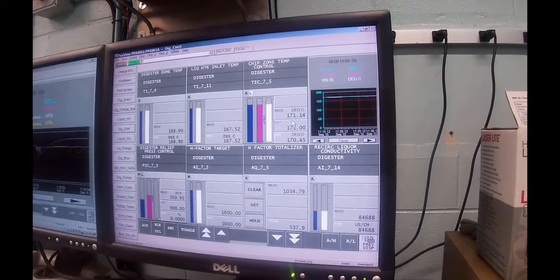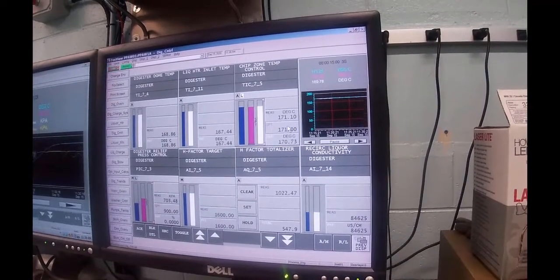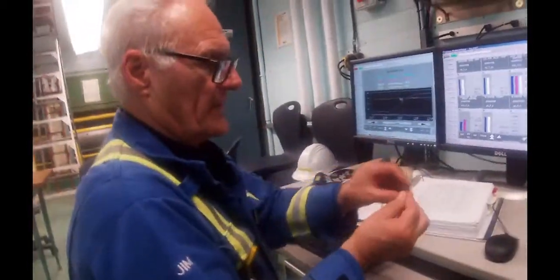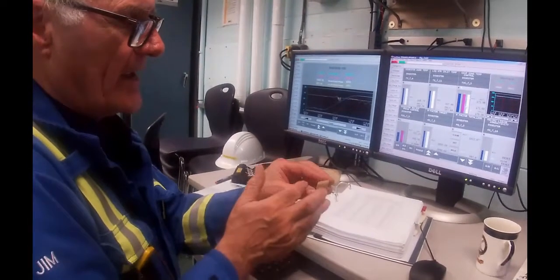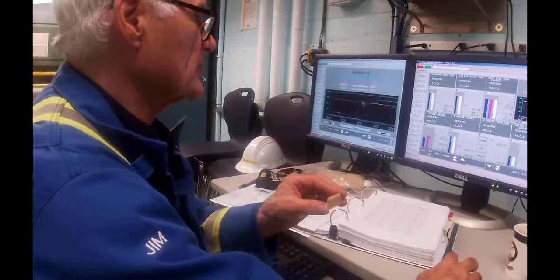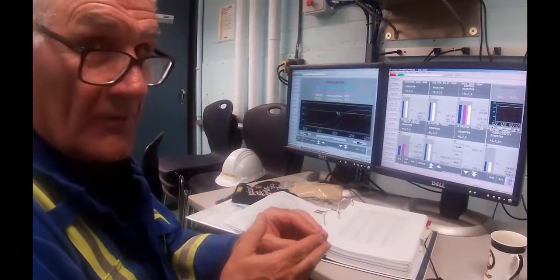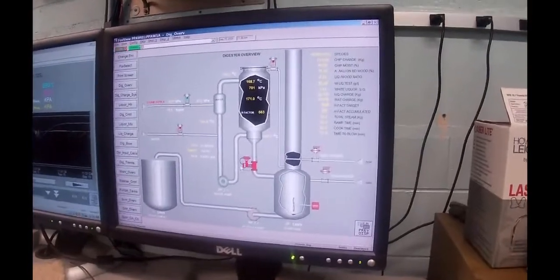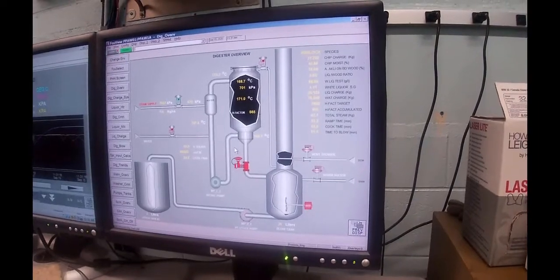The disadvantage of doing that is that when the digester blows, and I'll talk more about the digester blowing in the next part of the video, if the chips are really hot when they blow apart, it'll tear the fiber. The chip itself still looks like a chip inside the digester, even though all the lignin is dissolved. When you open the blow valve, the pressure drops, and the water inside flashes into steam, because inside that digester we're running at a digester pressure of 700 kPa right now, and when we drop the pressure down to zero, the water inside is going to flash, and it literally blows the chip apart. Hence, if I go back to digester overview, this is called the blow valve. The chips will still be chips up here, and as they go down through here, they literally expand and blow into pieces.